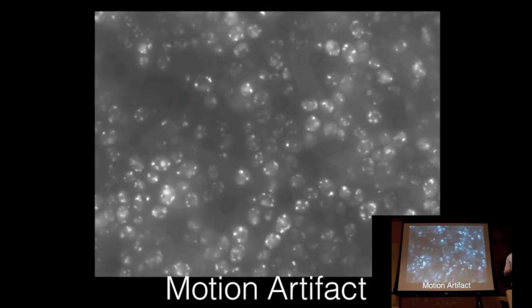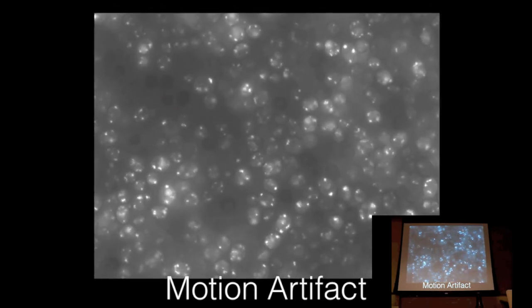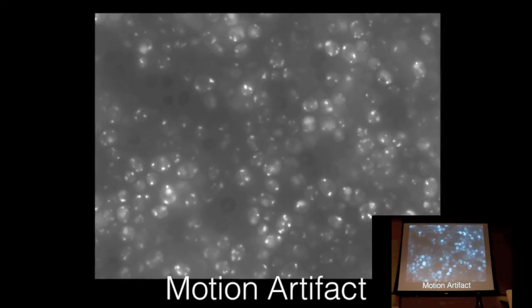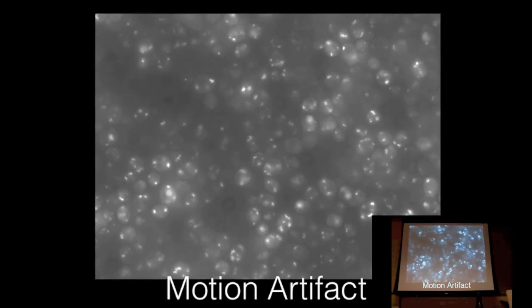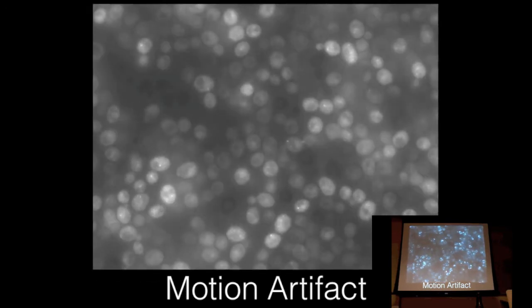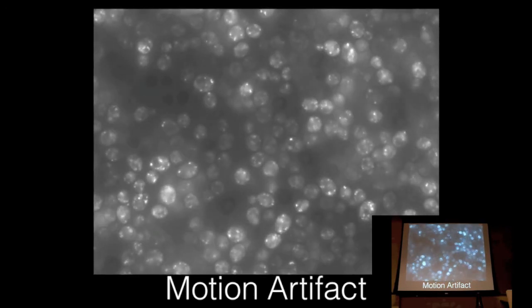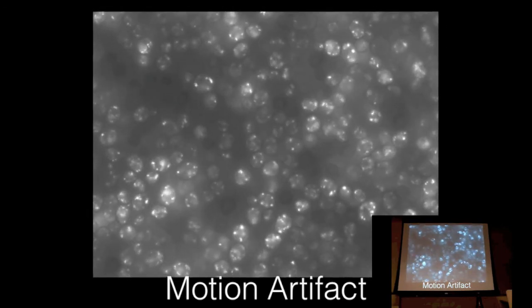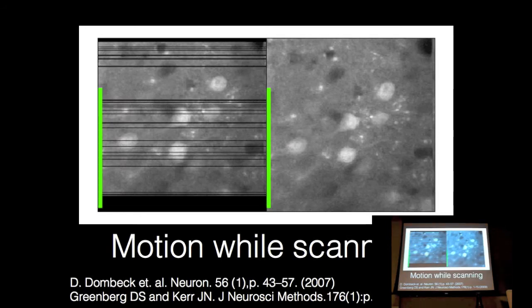Yeah, so there are no puncta at the beginning, and then as it warms up, the puncta form. It's a temperature-sensitive mutant, so they just diffuse, and it's not Z drift. That's just going from diffuse to punctate. Oh, okay, so I was confused. Usually we do measurements like this, a 30-minute movie, at time point 0 when everything is diffuse, and then the first puncta form after 4 or 5 minutes. The biology confused me into thinking that it was out of focus, but it's not. Shows what you know. Coming in all big with your algorithms.